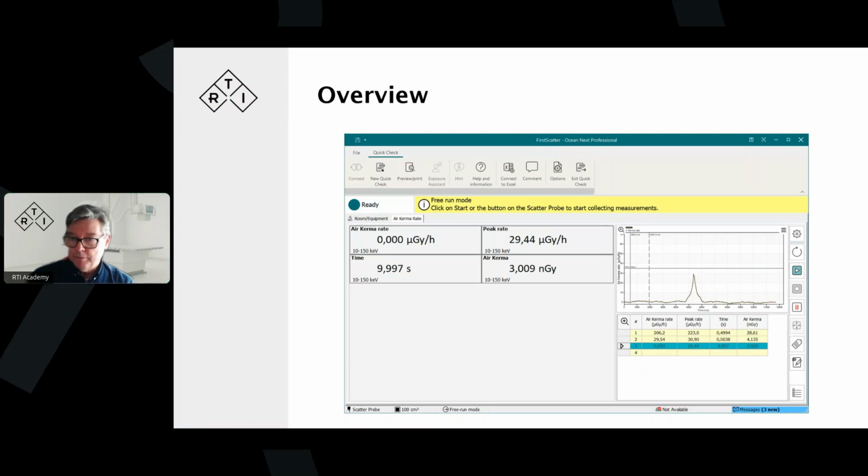There we go. Yugesh Kumar, that was the answer to your question. Can we measure in the hand? Yes, you can, of course, but you need to allow for the response time if you're holding it in your hand. If you hold it in your hand, fine, that's good, but move it taking into account the response time, typically half a second. Give it time to pick up.